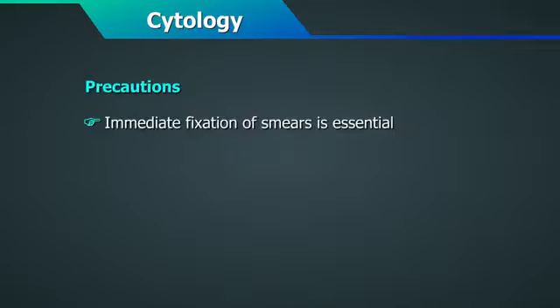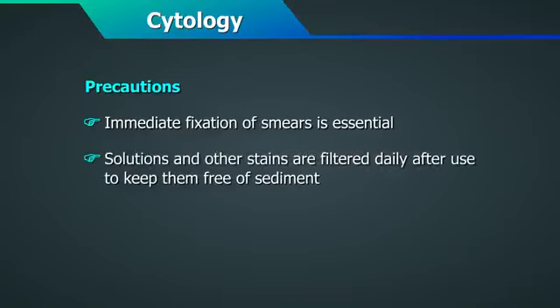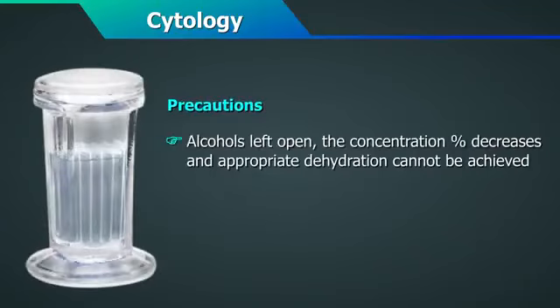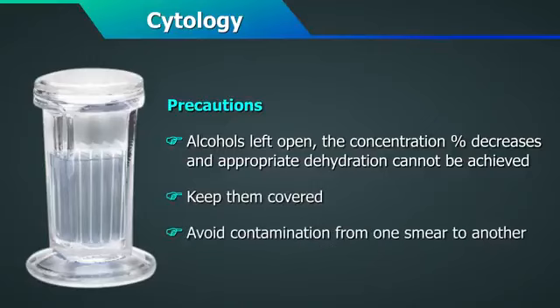Precautions. Immediate fixation of smears is essential. All solutions and other stains are to be filtered daily after use to keep them free of sediment. Alcohols are hygroscopic and will absorb moisture from air, especially in humid climates. So if alcohols are left open, the concentration percent decreases and appropriate dehydration cannot be achieved. Keep them covered. Avoid contamination from one smear to another.